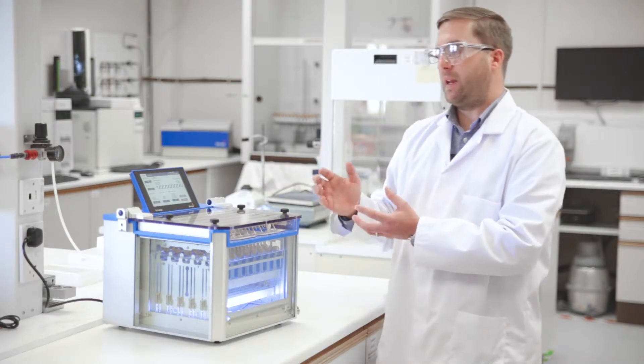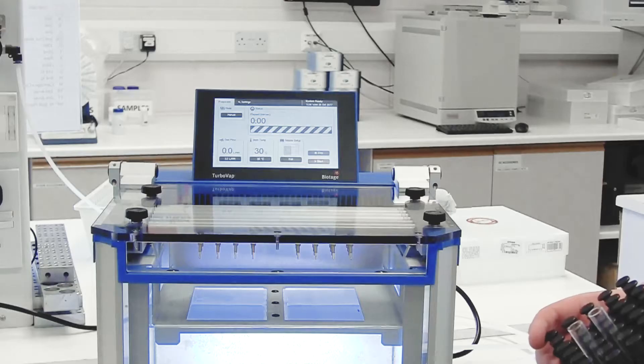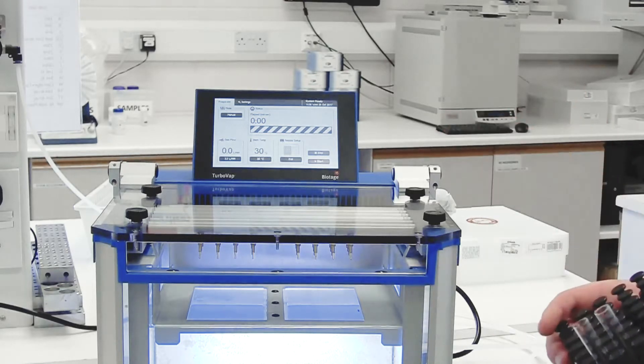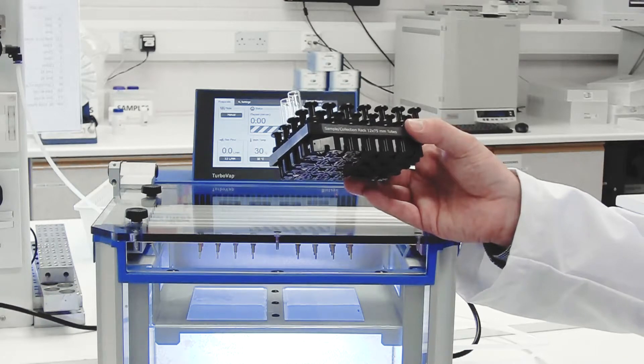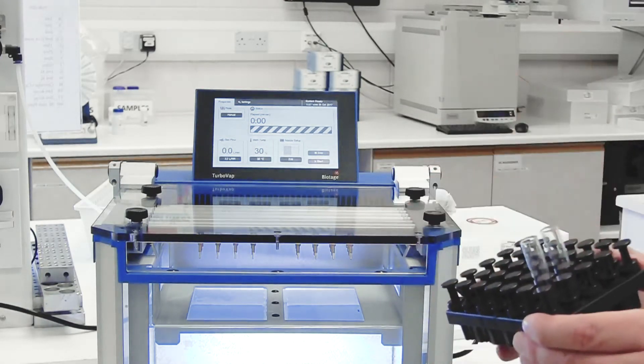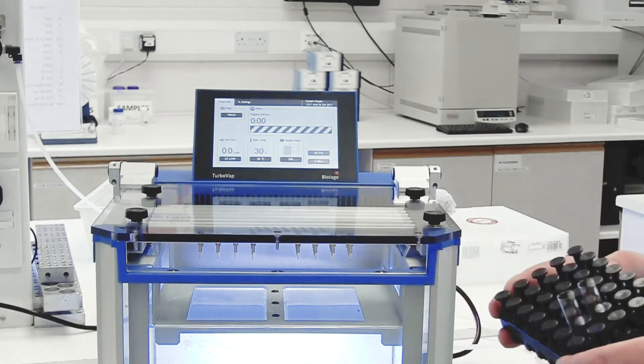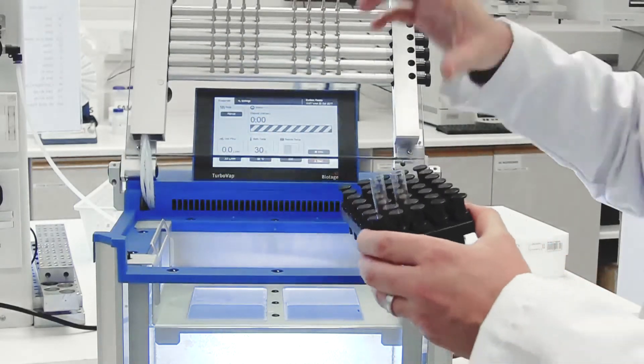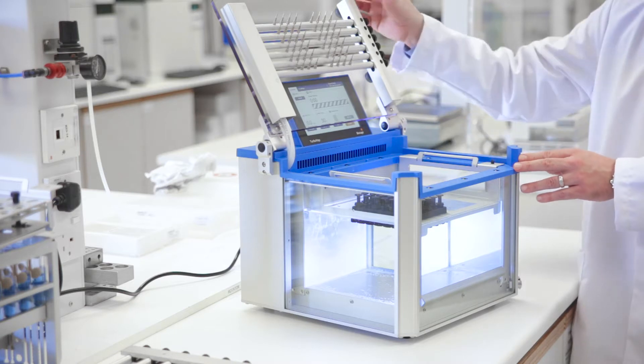With this release, we bring in the TurboVap EH, which streamlines your processing from the Extrahera platform onto the TurboVap. I've got an Extrahera collection rack here. Let's assume we've eluted our columns, we've got our sample extracts here, and we need to evaporate these either for solvent exchange or to achieve our LOQs. You're able to take the Extrahera collection rack and place it straight into the TurboVap EH.